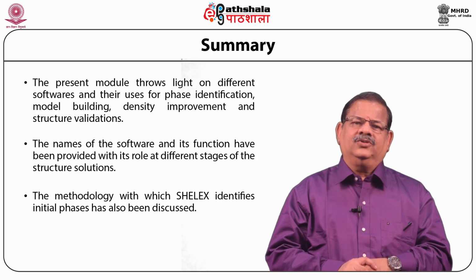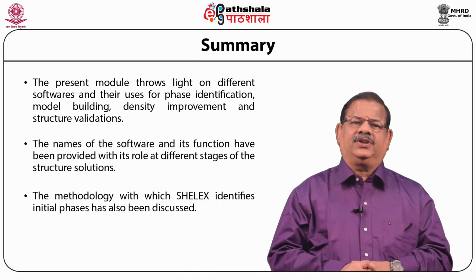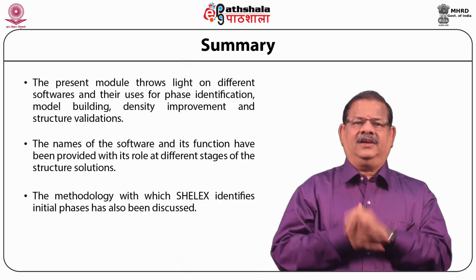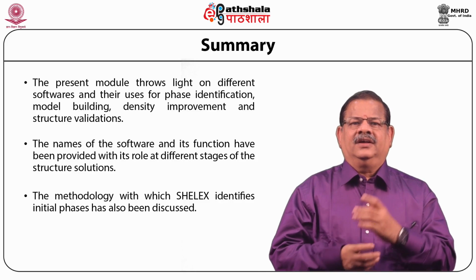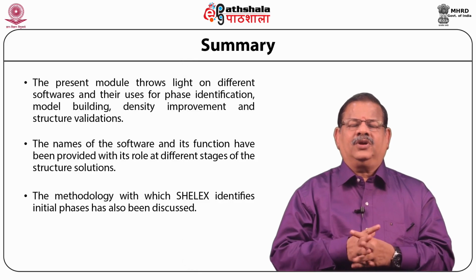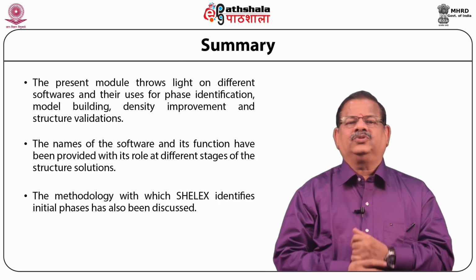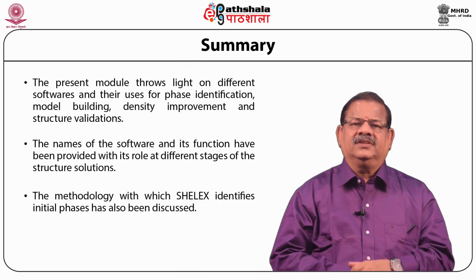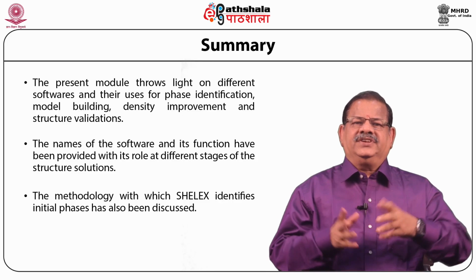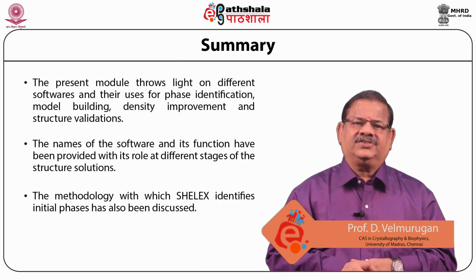And this could be done usually when you take your selenomethionine derivatized protein to the synchrotron and you collect the wavelength at a value where you have the absorption energy of selenium nearby. Similar pronounced anomalous scattering can also be done using lab source data collection by soaking with heavy atoms like iodine, europium, cerium, cesium and I3C, which will not disturb the overall structure.